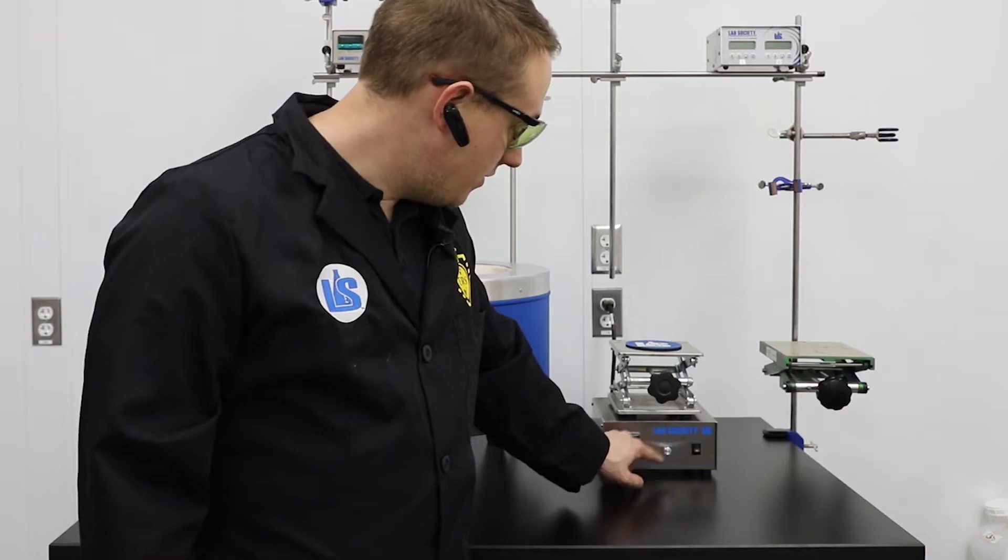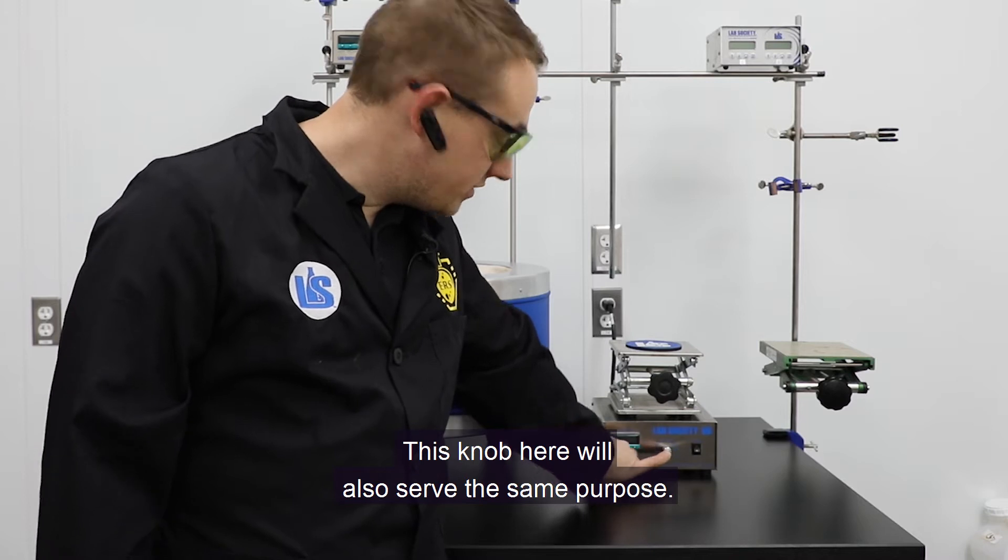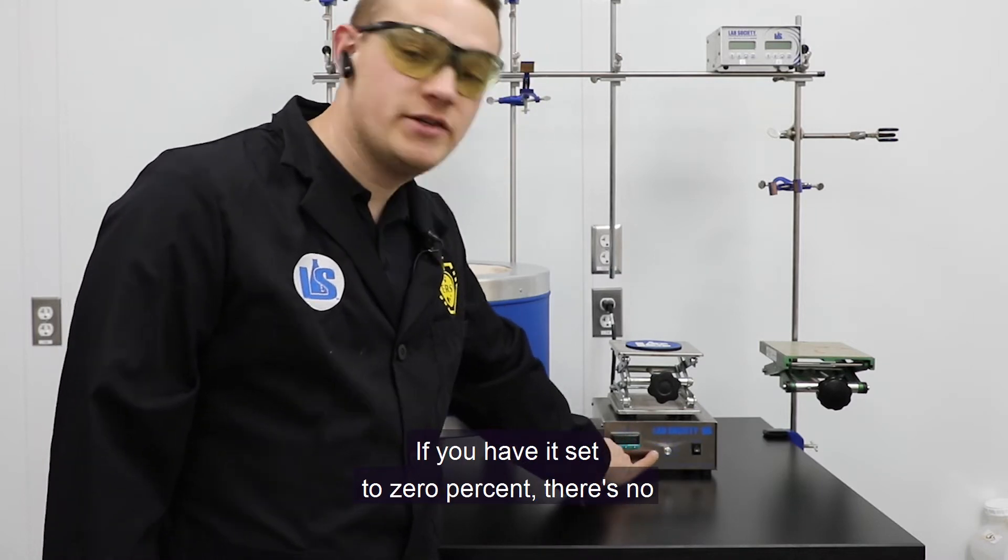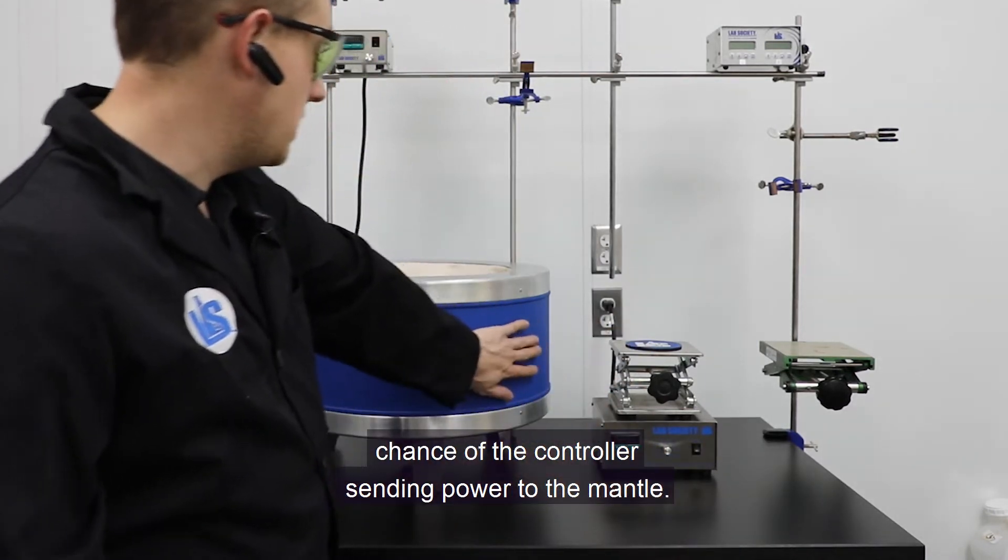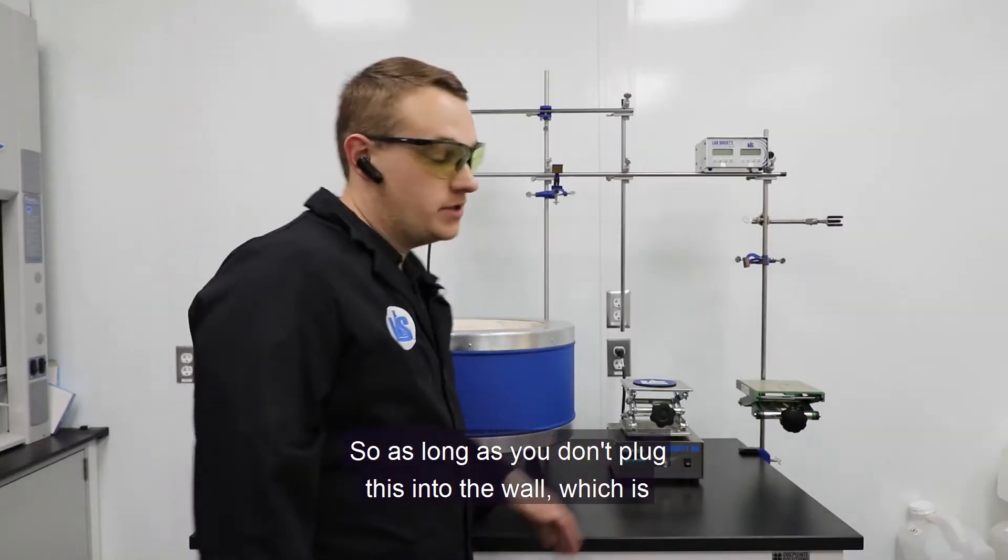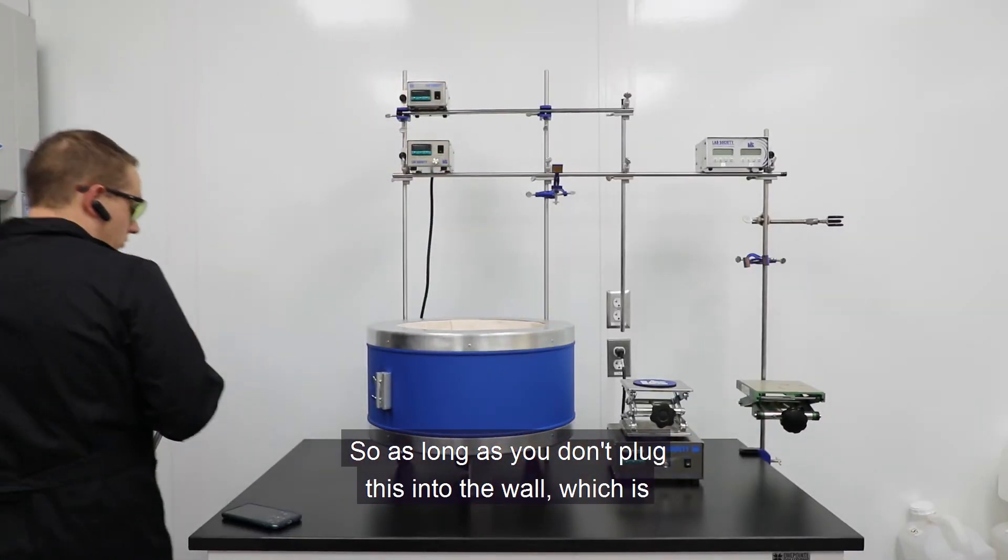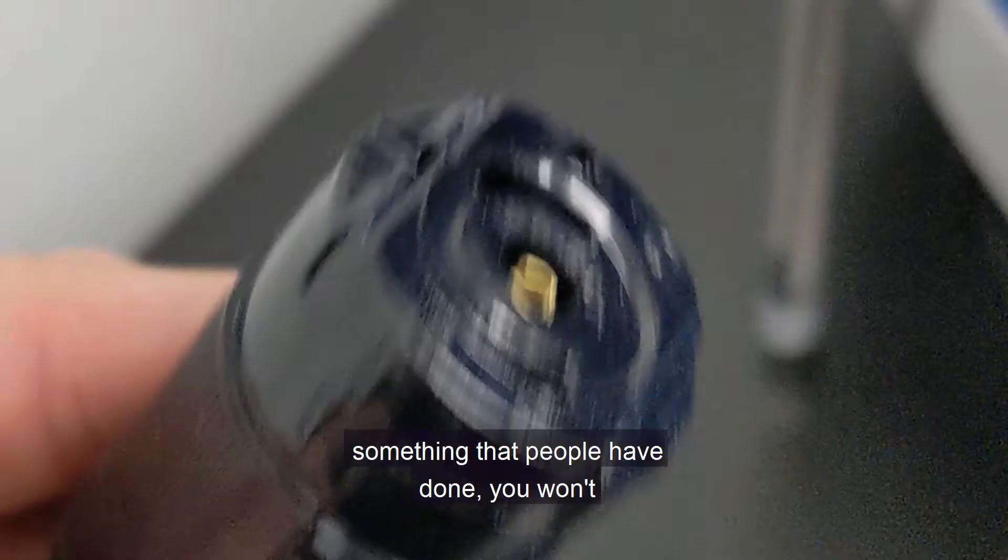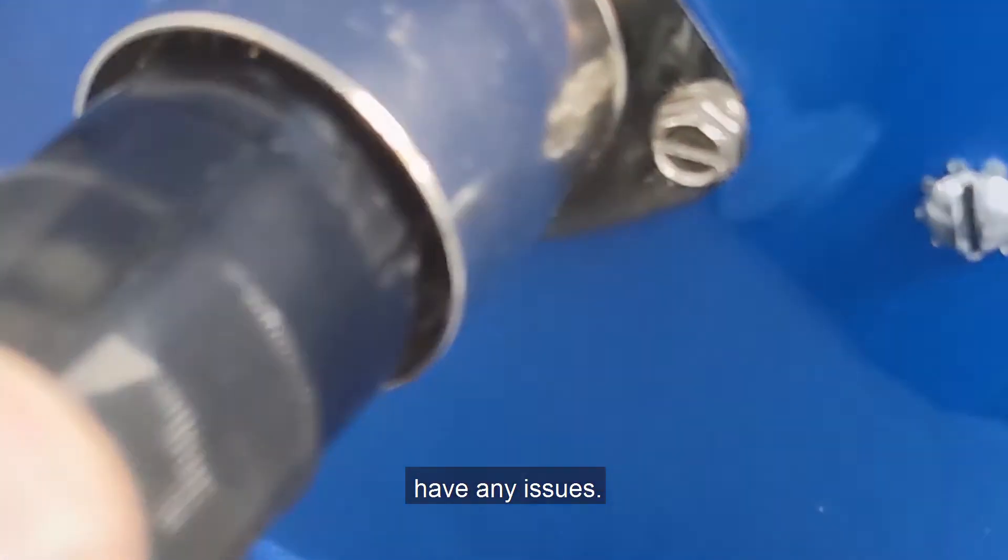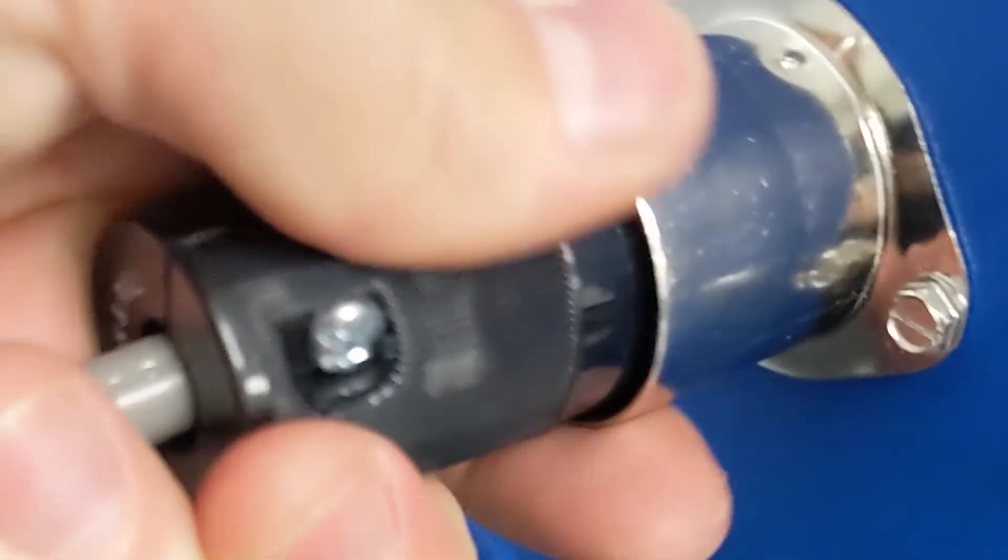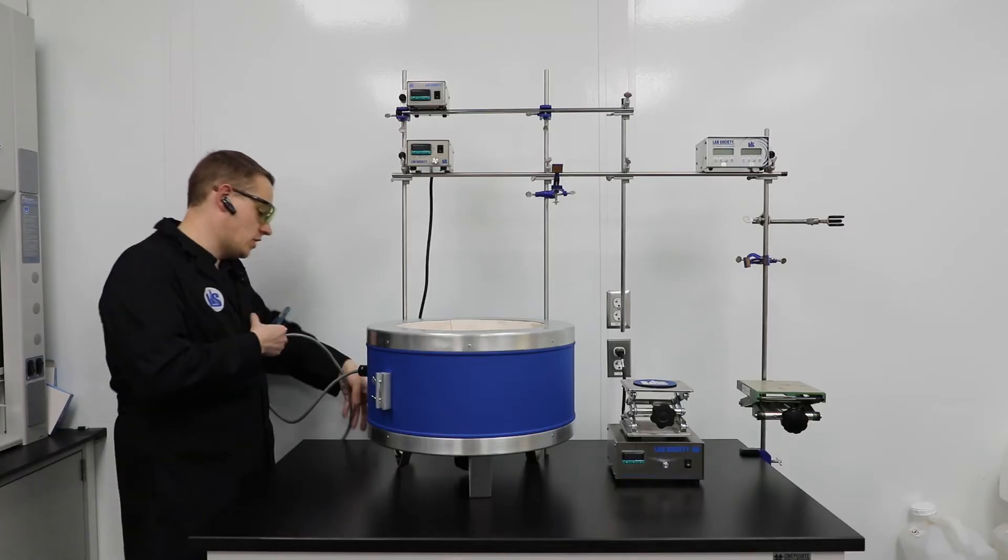This knob here will also serve the same purpose. Because if you haven't set it to zero percent, there's no chance of the controller sending power to the mantle. So as long as you don't plug this into the wall, which is something that people have done, you won't have any issues. Just like that. And this wire gets buried.